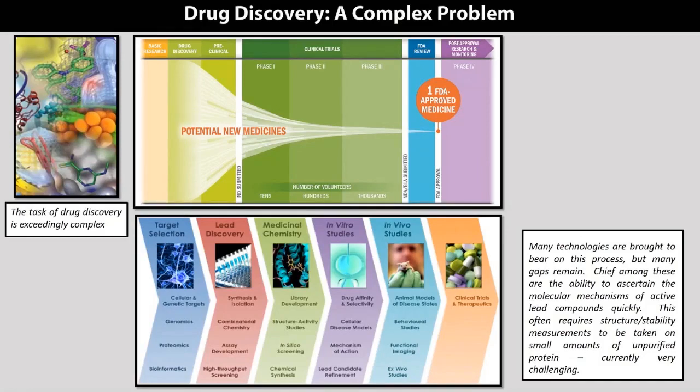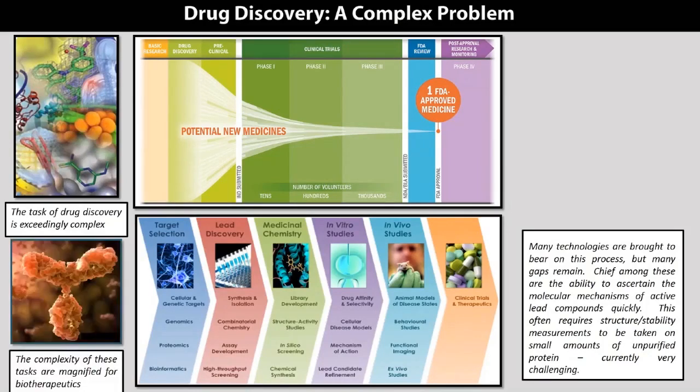But I would argue, as we start to think about the ways that this pipeline needs to be flexible to accommodate different types of targets, perhaps those that are more coupled to disease via conformational switches than enzyme activity, one needs to think about how to put structural biology more front and center in the context of how we think about drug screening. And I would argue that this challenge becomes even more important to consider when thinking about biotherapeutic development, when the proteins involved here act as both, obviously, the targets as well as the drugs, and have their own dynamism and structural manifold to consider when thinking about their mode of action.